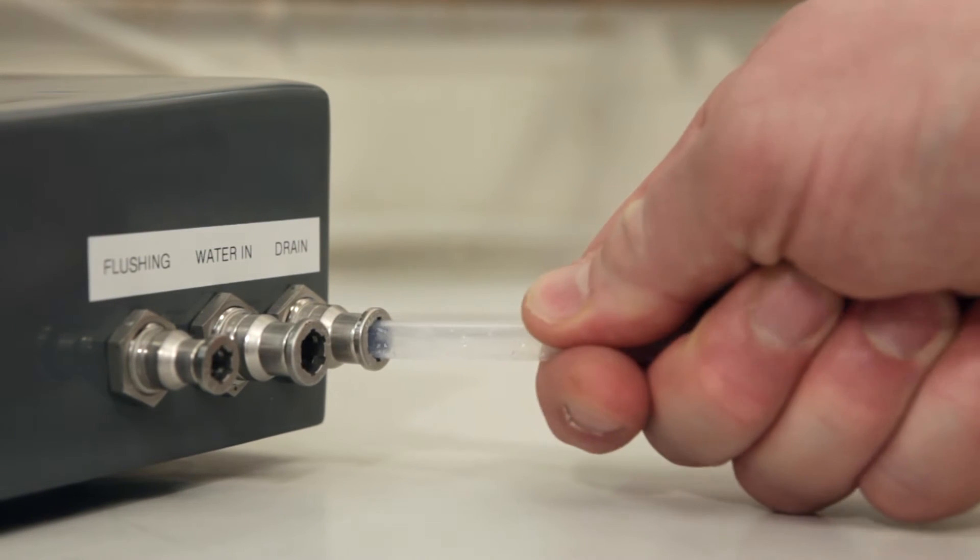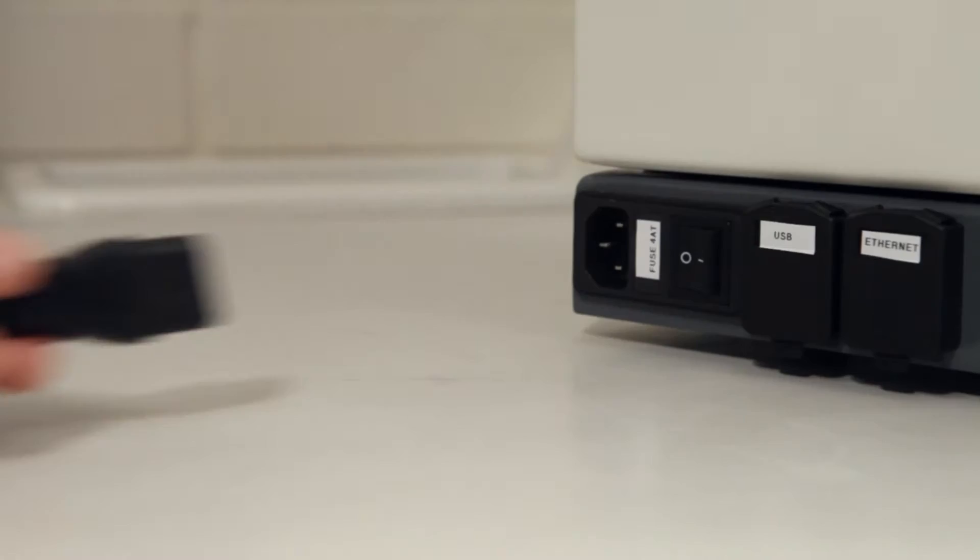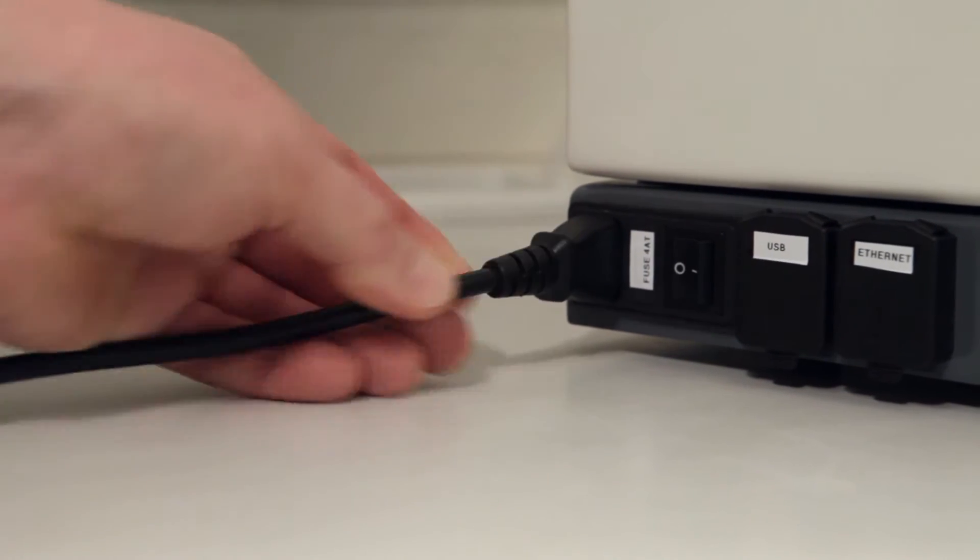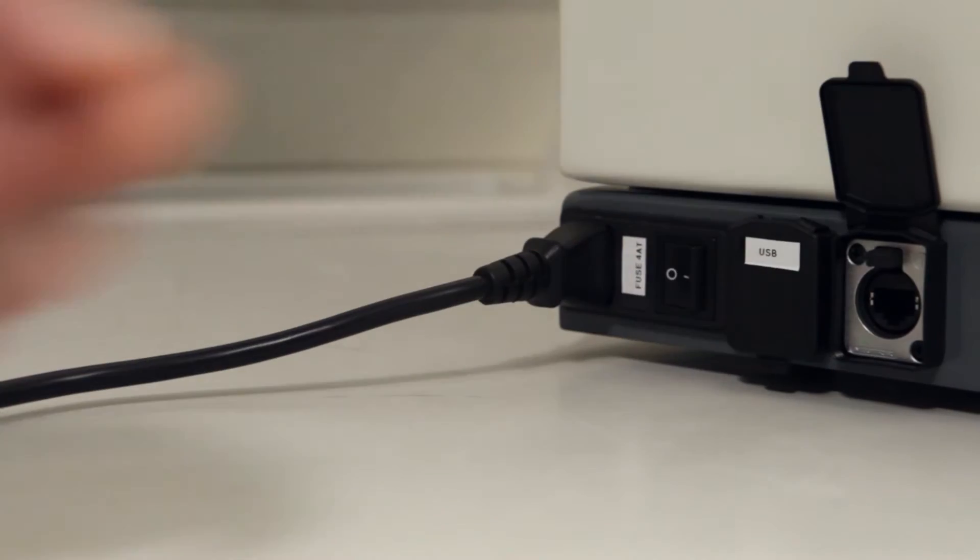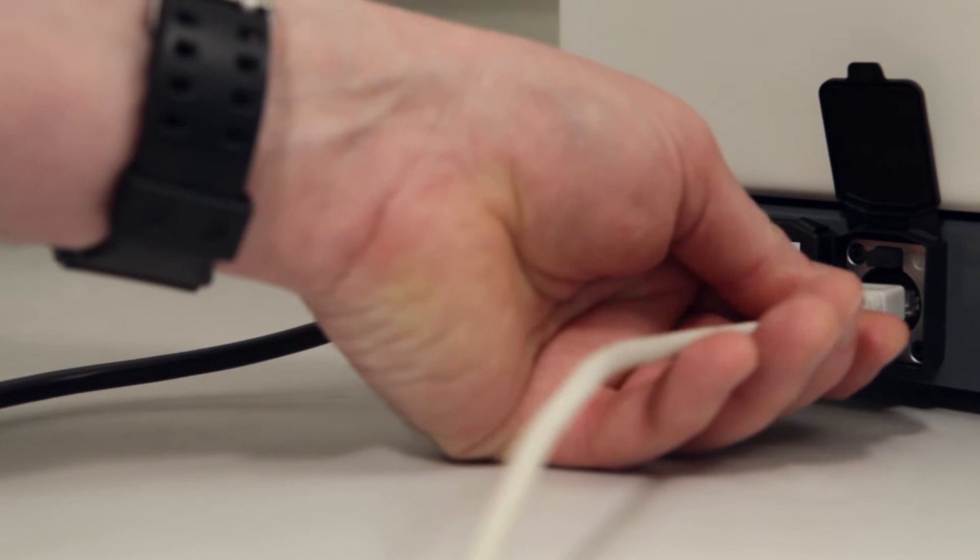Getting the unit up and running is fast. It only takes a matter of minutes. Simply hook the Valmet FS5 up to the water lines, the mains and the network and start analyzing.